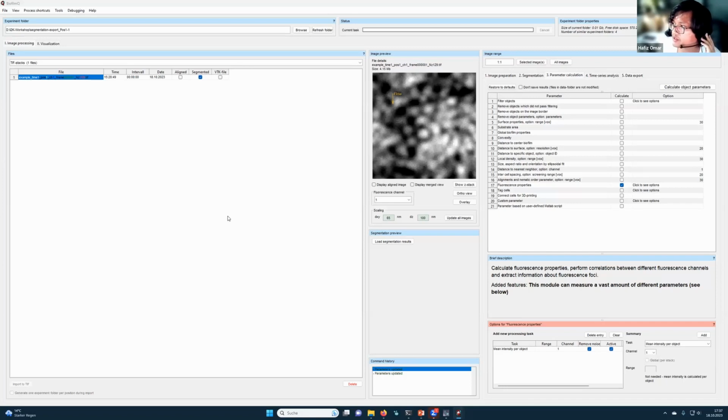Okay. And I'm a bit confused because you also show the red surrounding the cells. What are those? Are they also from Napari? Yeah. Exactly. These are exactly the same outlines that were made in Napari, but now imported into BiofilmQ. Okay. Thank you.